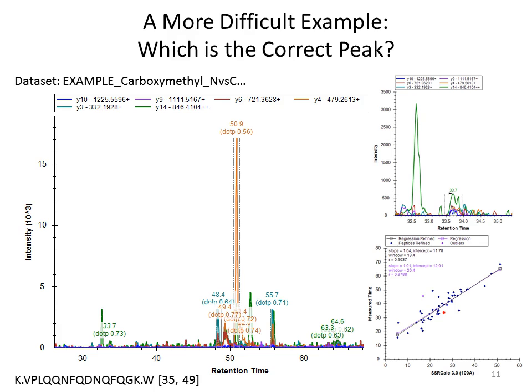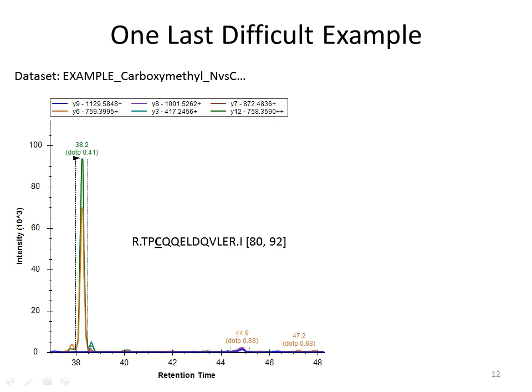If you ever have a completely flat signal for a transition that you observed in a spectral library, you're going to be like, I don't know that I feel comfortable with that. There should always be a little bit of something, unless you're monitoring like all 20 transitions or something. But my eye jumps to that now. I look for that same repetitive thing when I look for all my peptides. And then you can see it's decently close to the curve, retention time-wise. If I picked anything at 50 minutes, it would be up in this region. It would be just an outlier.